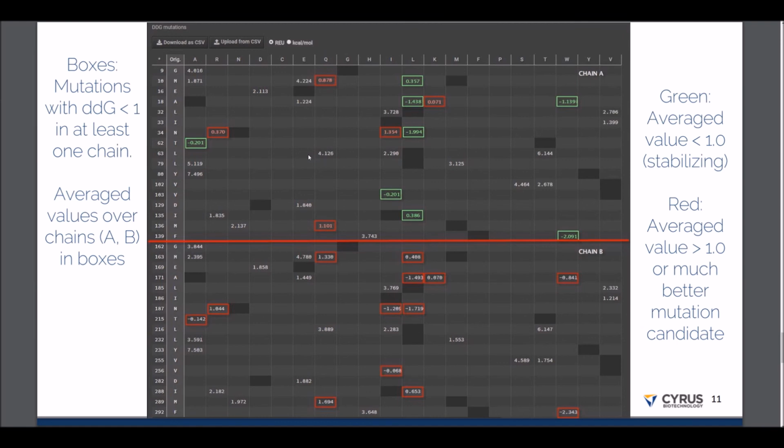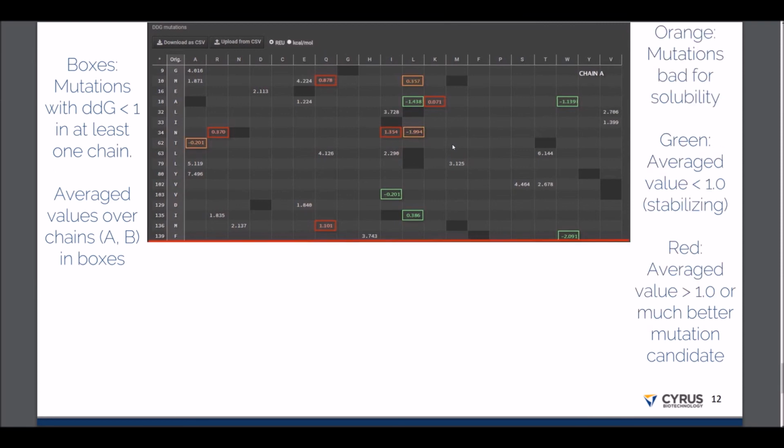But let's really focus this even better by focusing now on these positions that are marked in green, which are the most favorable on an average basis mutations suggested by the results of flex design. So one thing that's very interesting about this is that if we continue on the analysis here, now I've just removed the bottom part because it's not really necessary. It's symmetric in sequence, and I've done the analysis in the top part.